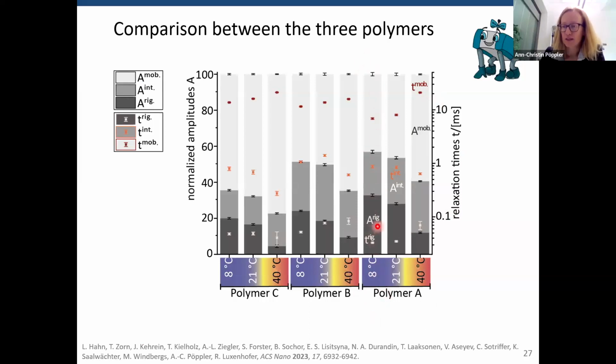So the good thing that we found was that the mobilities and these regimes were in agreement with the gel strength that we got from rheology. So we could already correlate what we found with the low field NMR with other methods that have nothing to do with NMR. And also there were agreements between this and molecular dynamic simulations, which was encouraging.